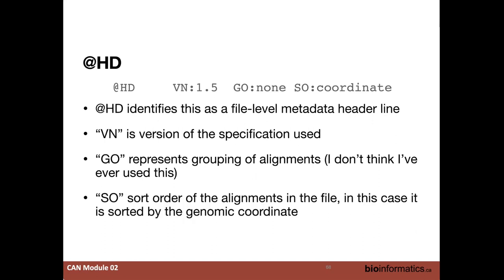The SO, however, that SO tag is very, very important. It's one of those things where you can take a file, and we'll get to this momentarily, and sort it, but how many different ways can you sort it? This tells you that it's sorted by the genomic position. So it's based on the chromosome as well as the position itself. And we'll get to what all this means in a moment.